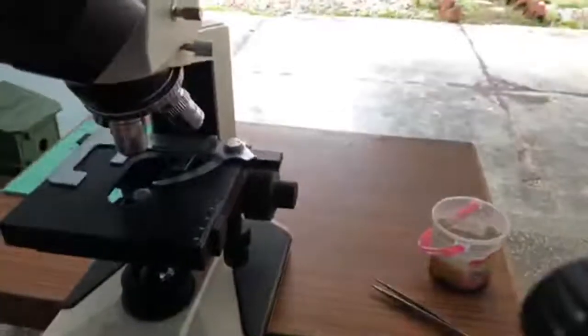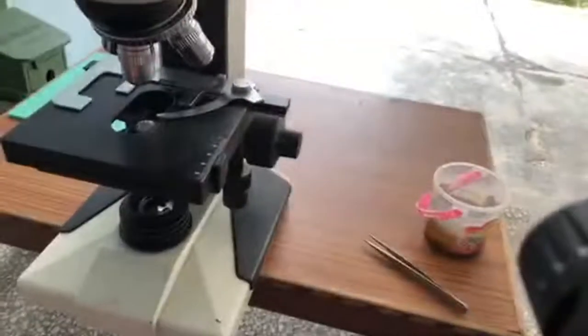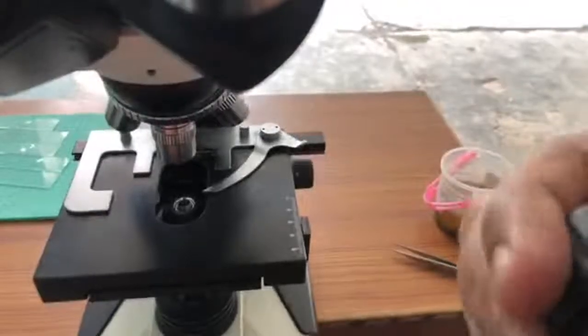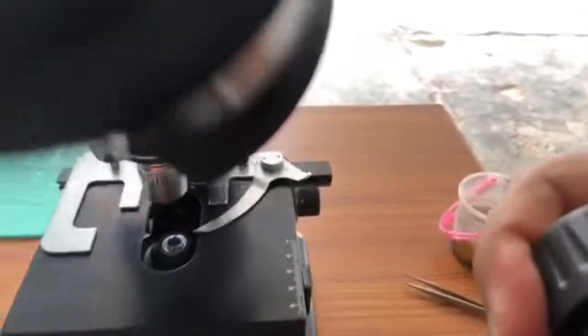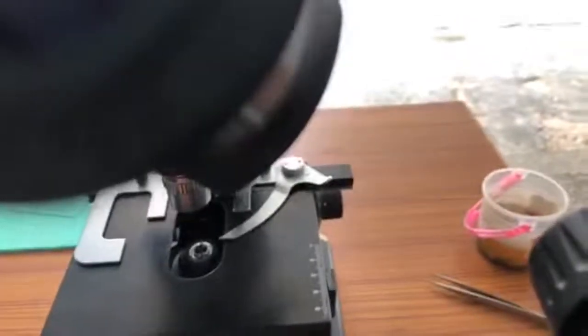All right, so I'm placing it up. Okay, yeah, here. It will be a while that I do the adjustments, and then we shall be ready. All right, so here it is.